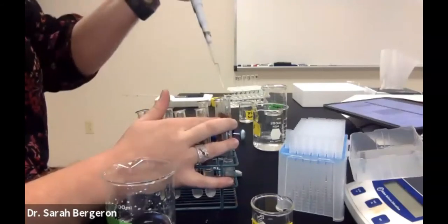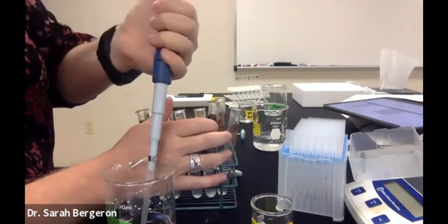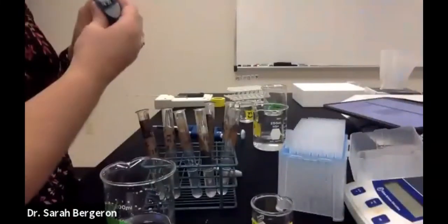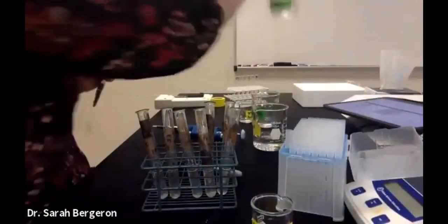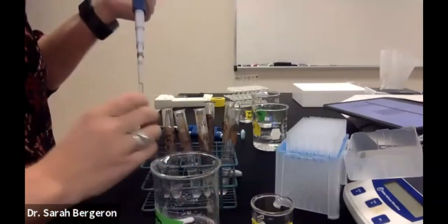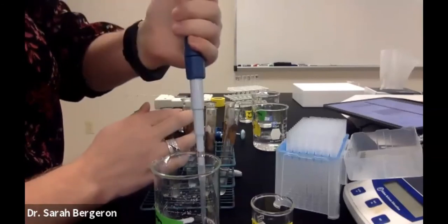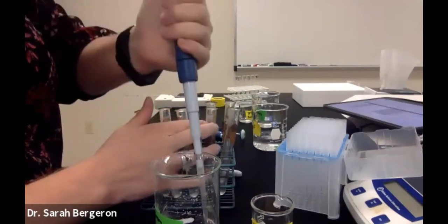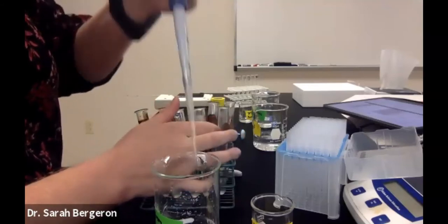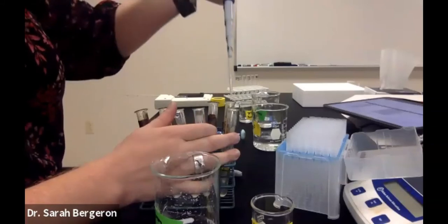And we're going to add our last reagent. I know, like, this is super exciting, right? Sorry you can't be here. I wish you could. All right, there we go. Okay, and then we need 500 microliters of our ammonium molybdate. Okay. And then we're going to give them a good mixing.